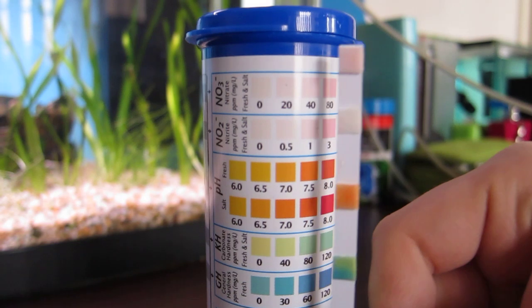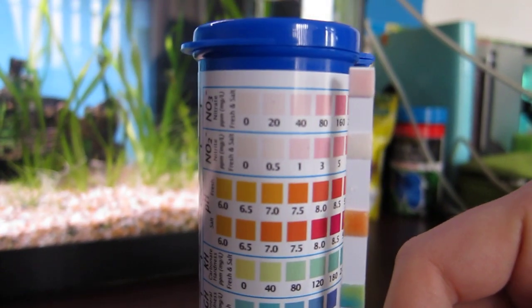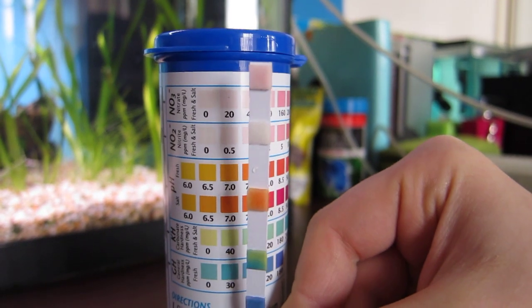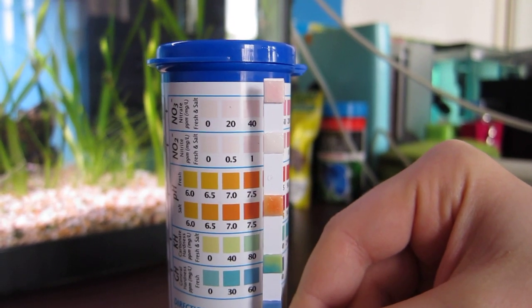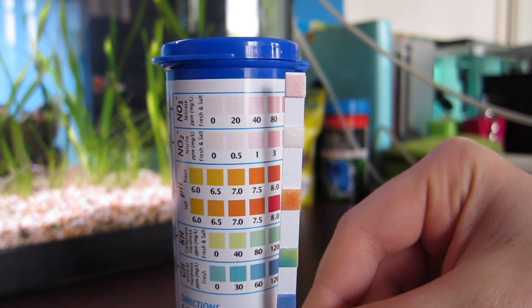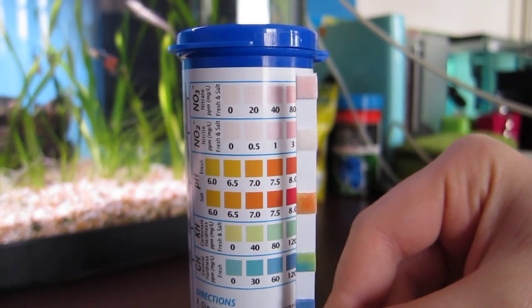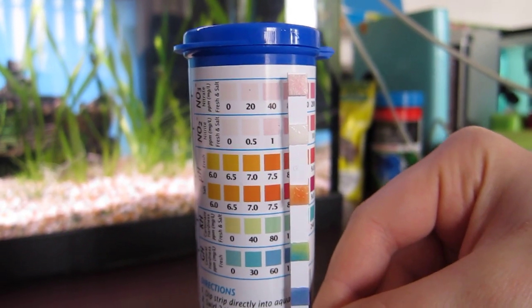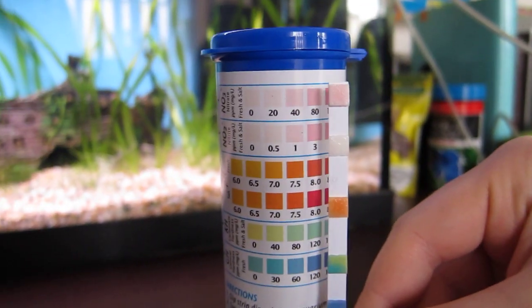This is going to be hard to tell on camera, but the nitrite looks probably between 0 and 0.5 — there's not much pink in it at all. The nitrate looks probably around 40, maybe a little bit more, somewhere in between those readings.